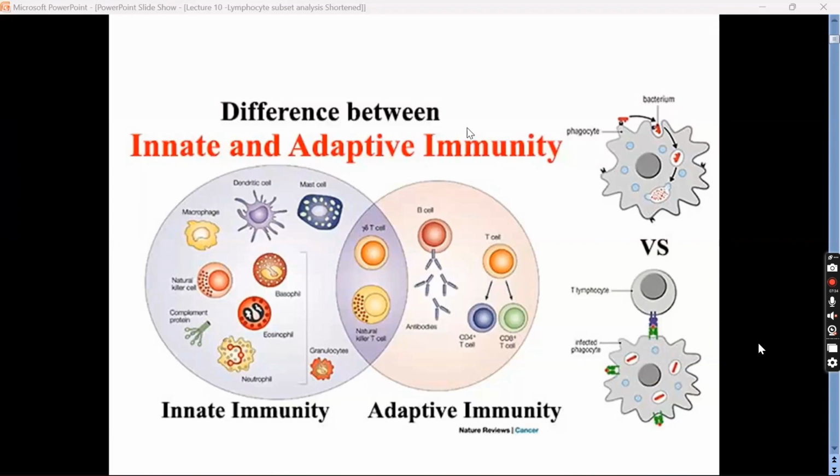Are the gates correct? Because as we saw, when the voltages or any other changes happen, these gates which have already been set become useless, and the population may fall outside. Since the gate has been set, it may show just 2 cells, whereas a big bulk of cells may be lying outside the gate, maybe with a lesser or a higher intensity. Then the value which you are giving is absolutely wrong. So you should have an idea.